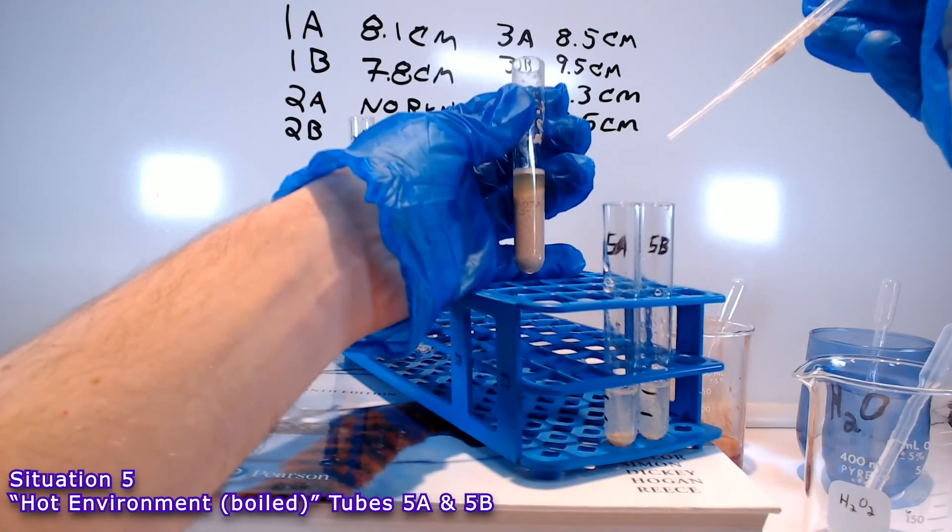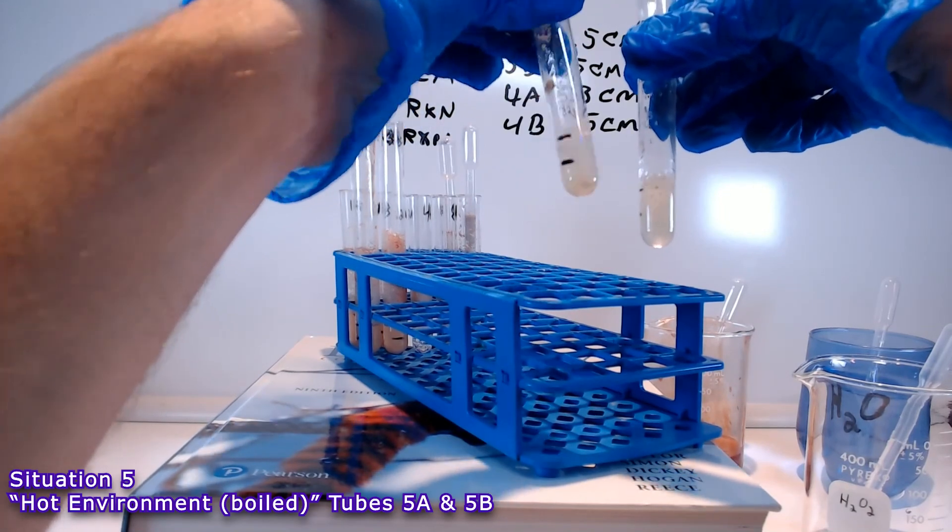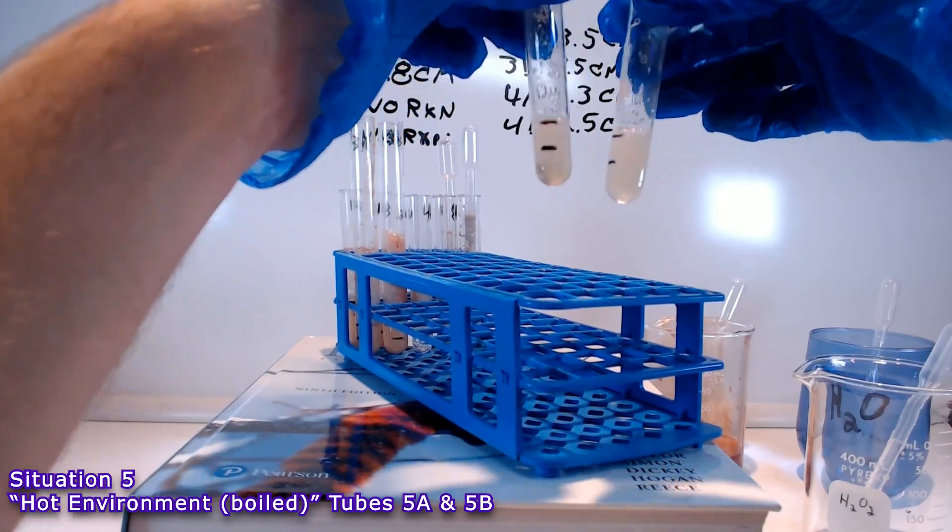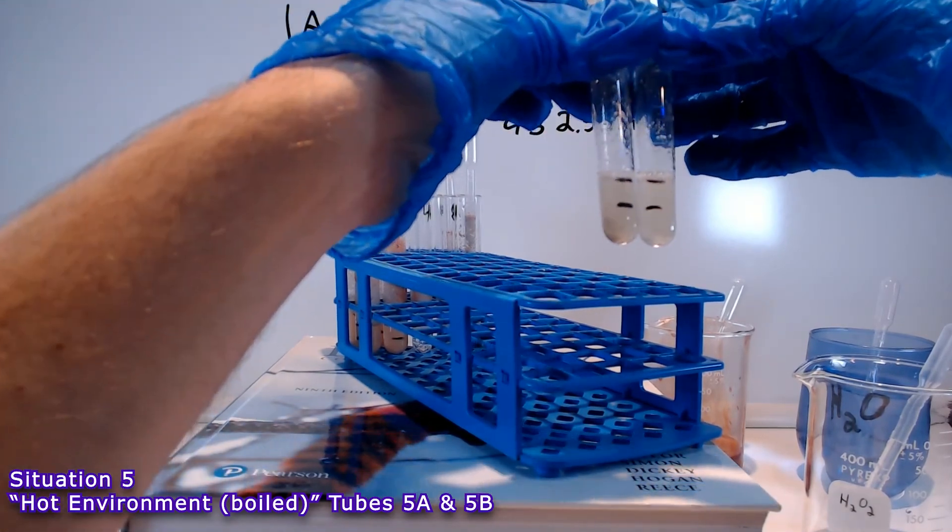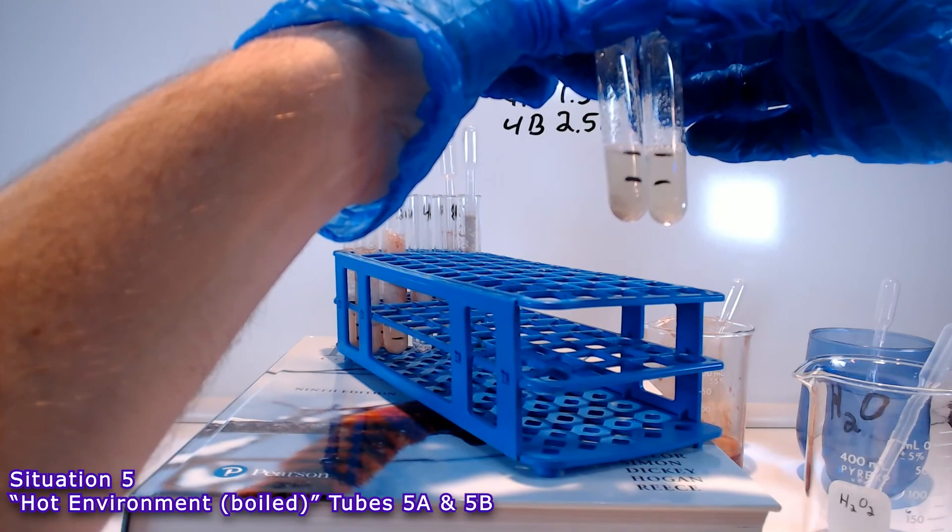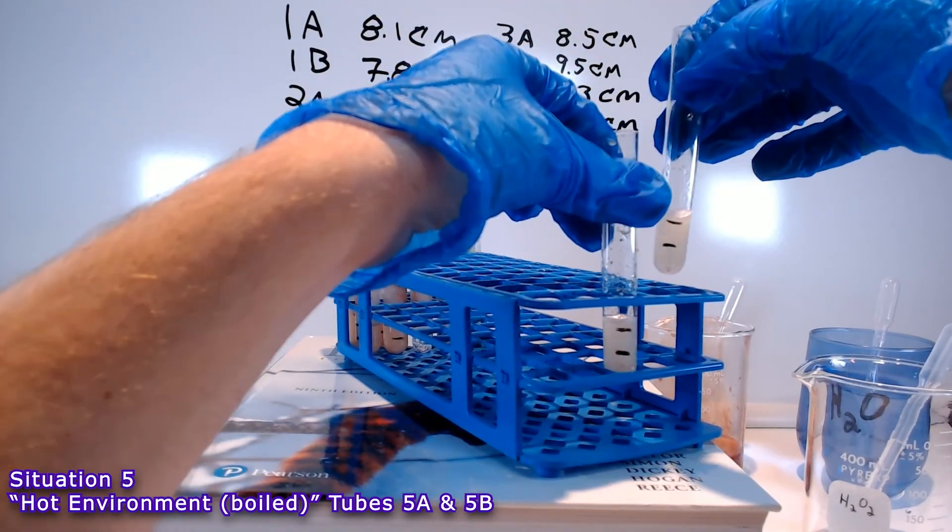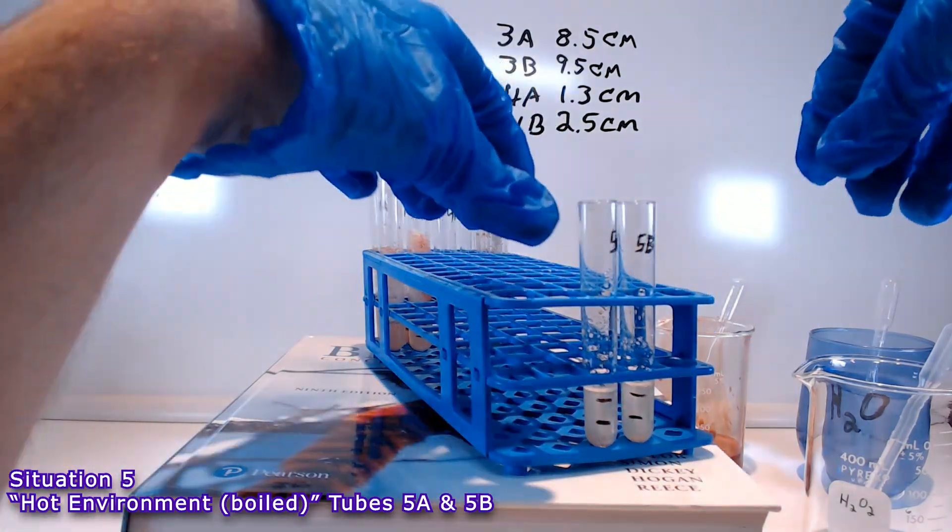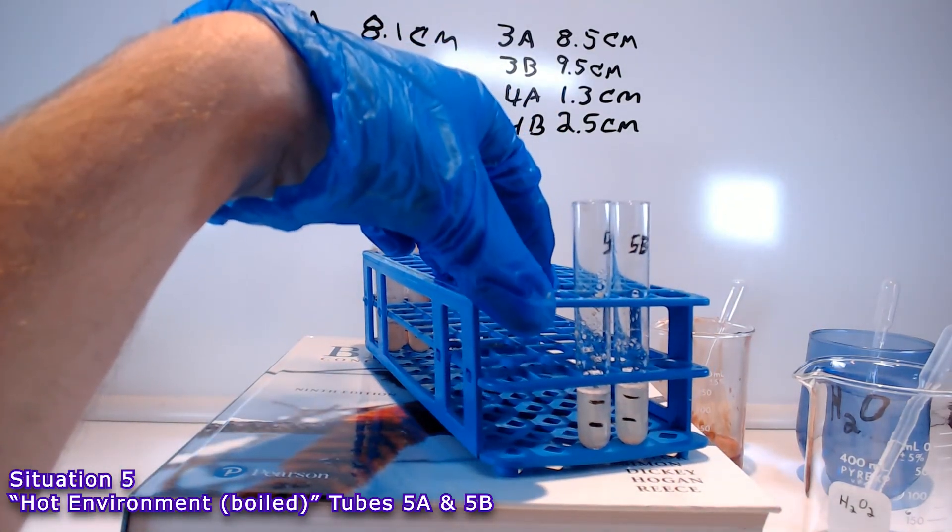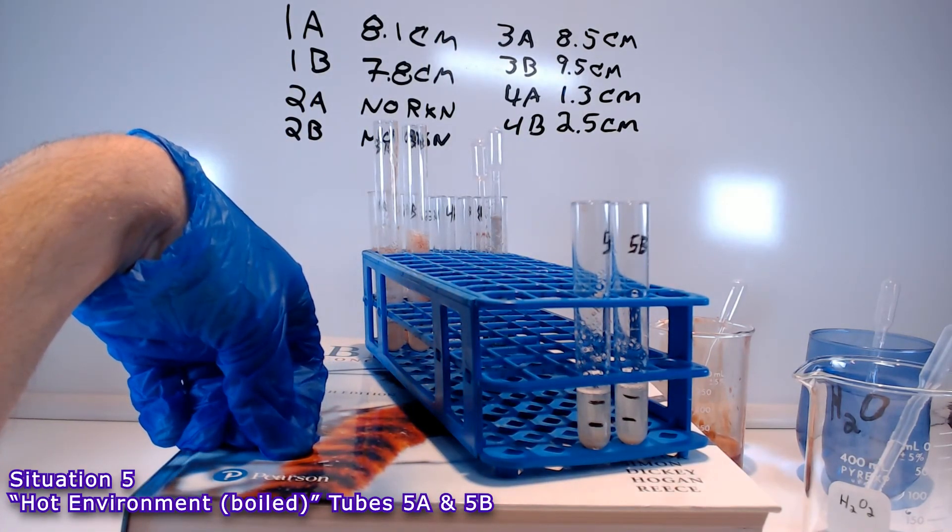Agitate the mix to make sure that it's in there. So, we have the catalase enzyme inside. We have hydrogen peroxide inside. But nothing's happening. After about 5 minutes, I call it. Tubes 5A and 5B. No reaction.